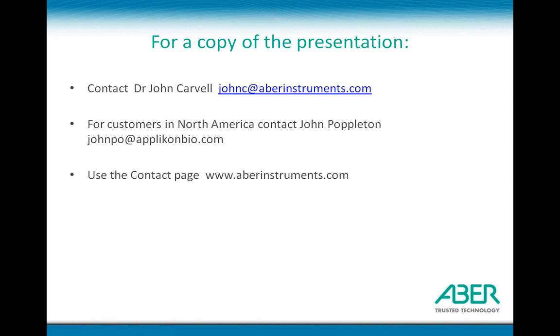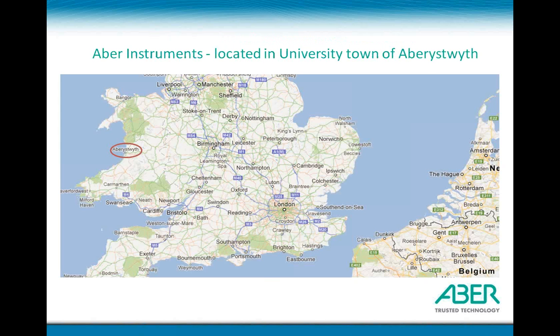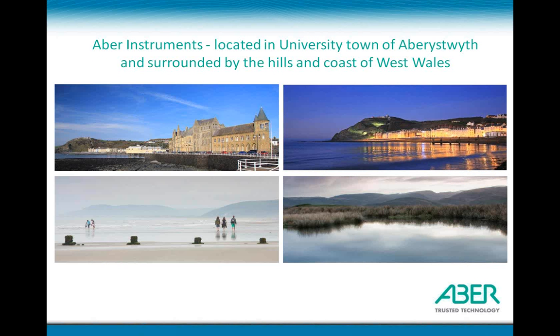Now I would like to begin the formal presentation with a few slides about Aber Instruments, the development of a biomass monitor for mammalian cell culture, and how products are distributed across the world. Aber Instruments is located in the town of Aberystwyth, which is on the west coast of Wales in the United Kingdom, overlooking the Irish Sea.